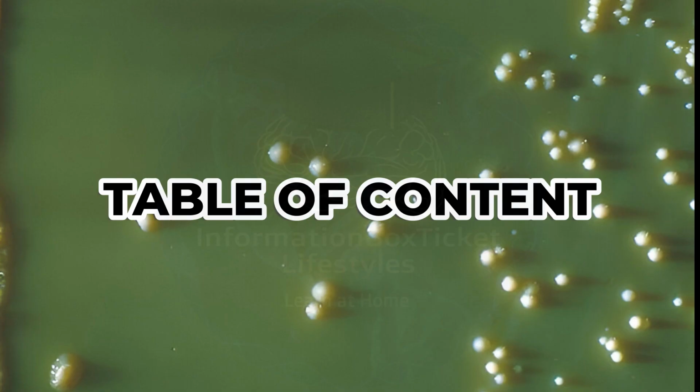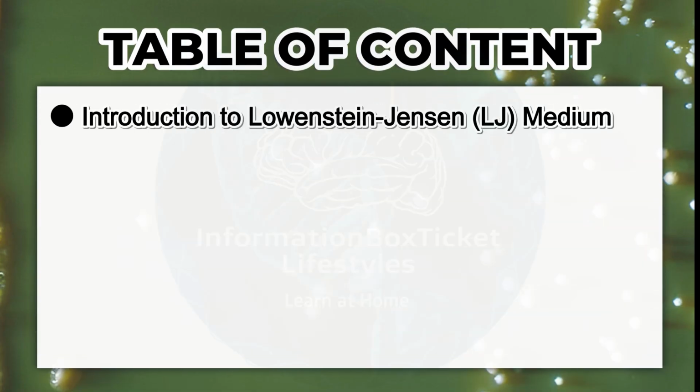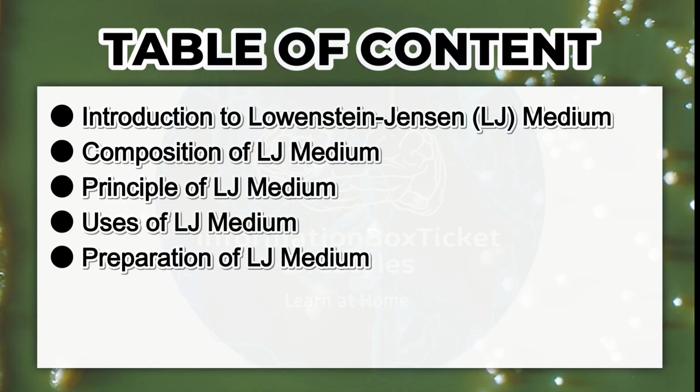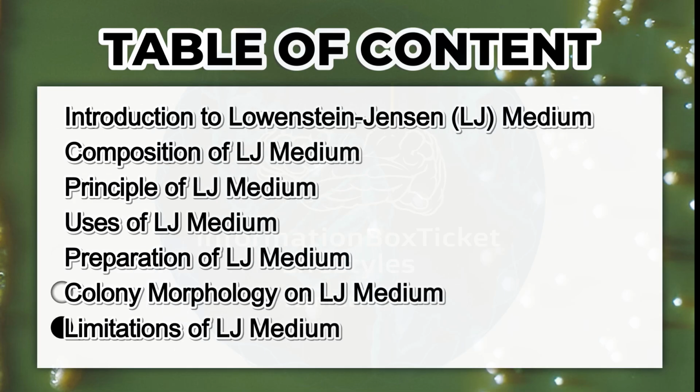Table of Content. Introduction to Lowenstein-Jensen, L.J., Medium. Composition. Principle. Uses. Preparation. Colony morphology. Limitations.